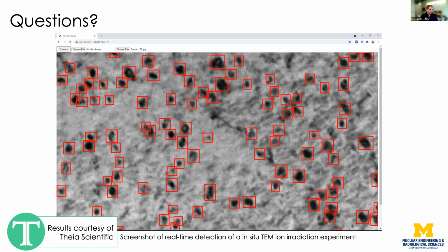So you're totally correct. A FIB is an ion beam, and so it is damaging. Right. And so you said about 200 nanometer thick samples? If I remember right, yeah, somewhere in that kind of space. And it depends, there's a whole optimization schema you have to do for every alloy. Some are 200, some are 120. You have to pulse it at 0.1 second versus 0.12 second.